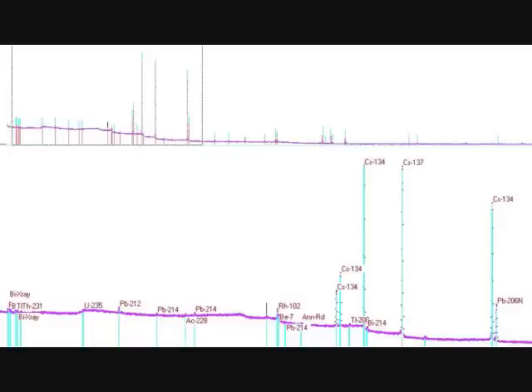As for alpha or beta emitters, such as strontium-90, which is widely known to have caused issues after the Chernobyl incident, we cannot determine them, unless they have gamma lines as well. Because, as I said, this is just a gamma spectrum, we cannot see anything else but gamma radiation. And X-radiation, of course, as that is the same stuff, basically.